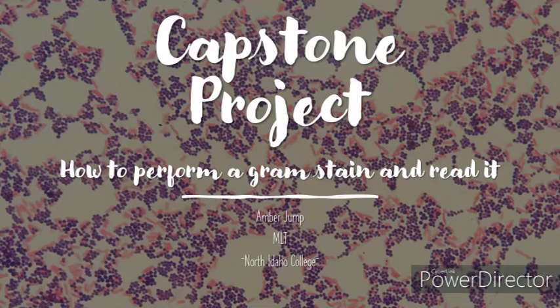Hello, my name is Amber Jump, and I'm in the North Idaho College Medical Laboratory Technology program. This is my capstone project: how to perform a gram stain and how to read it.